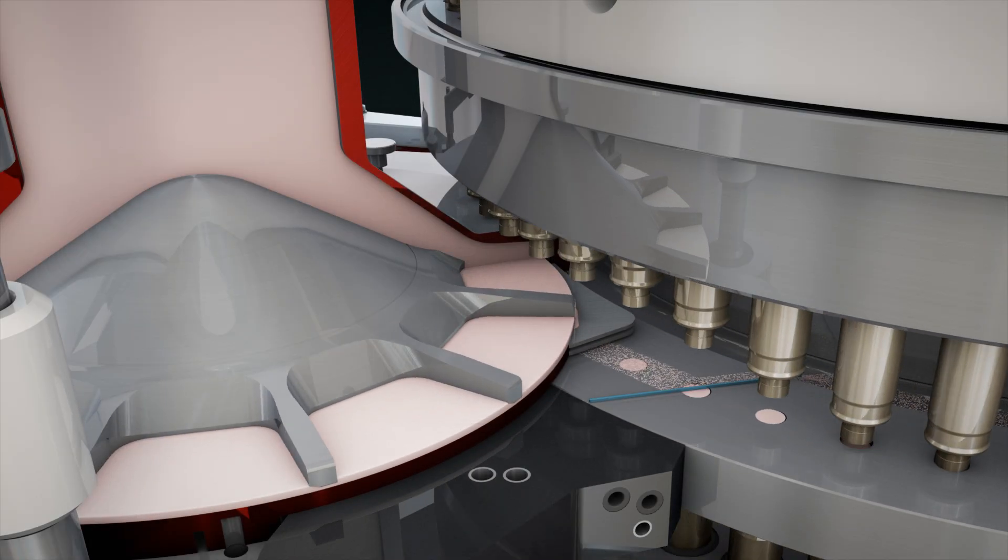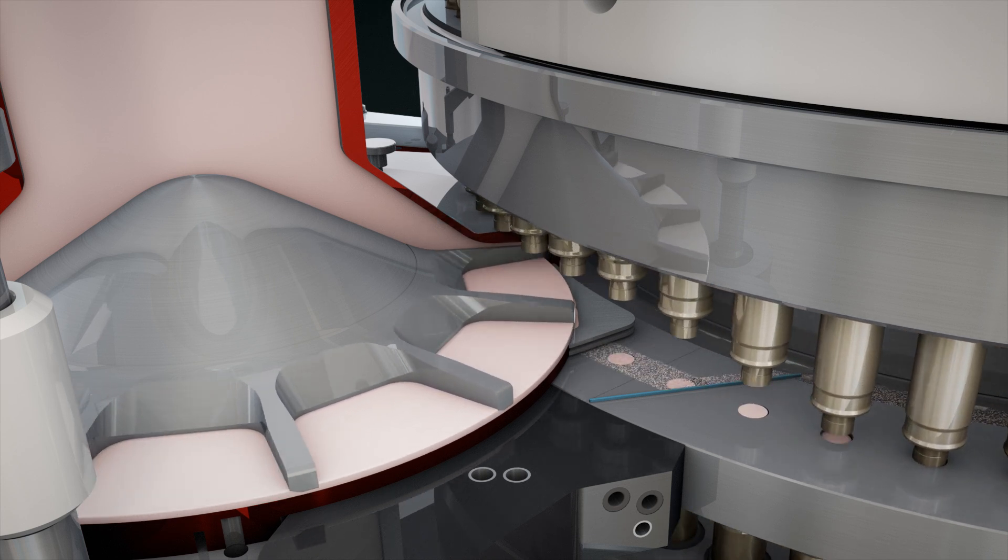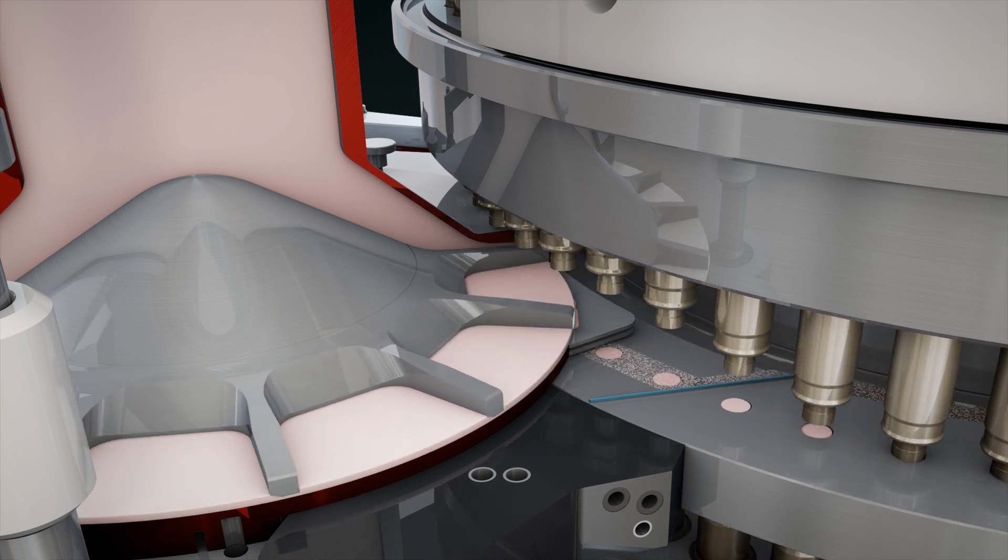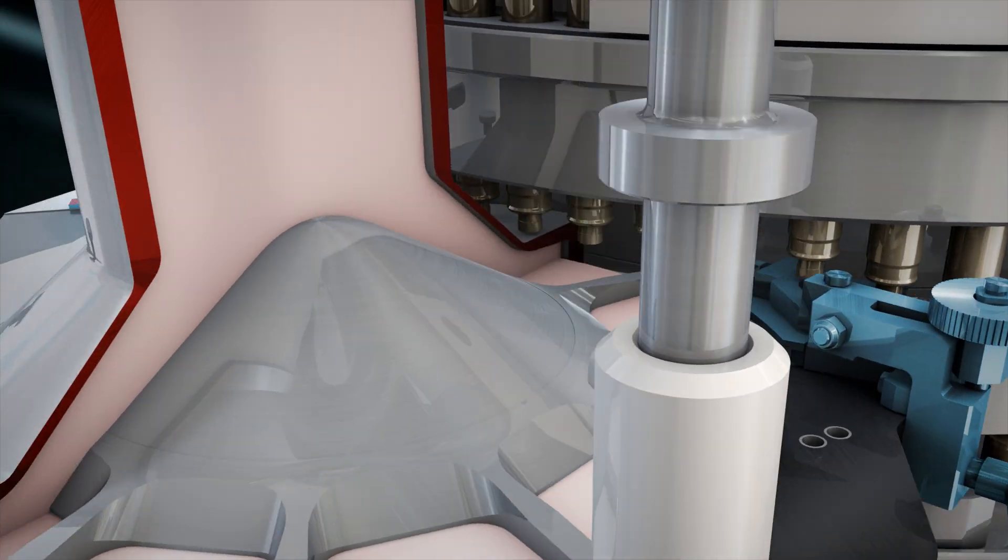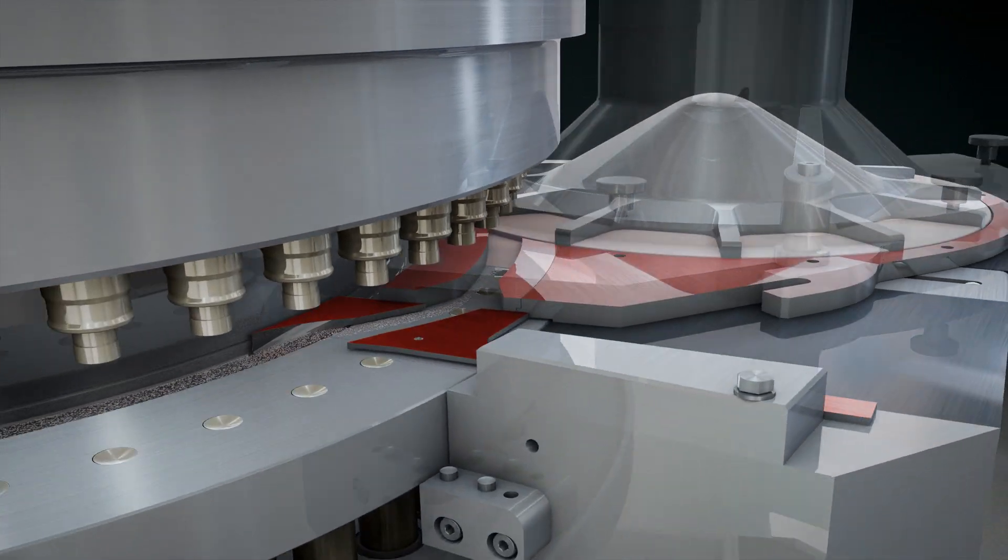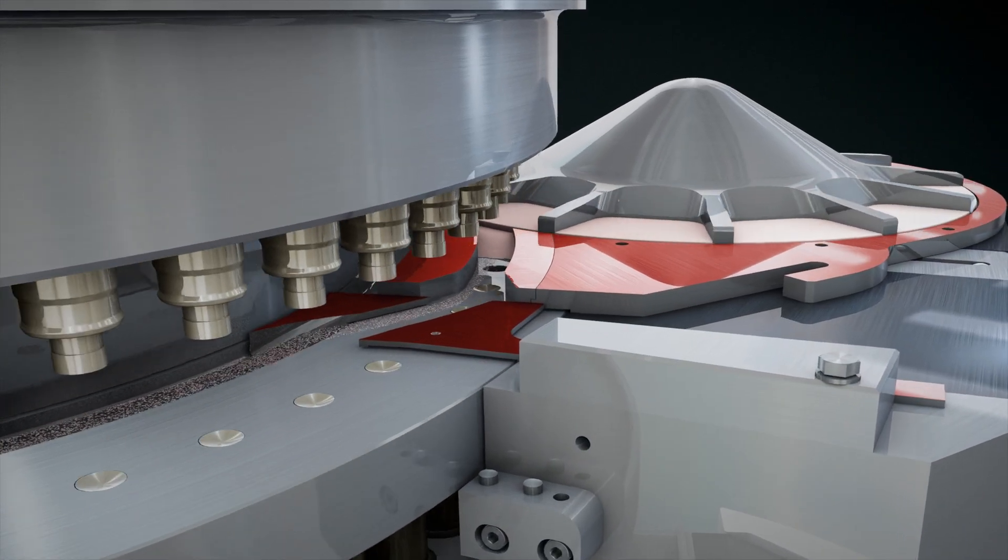Fine residue product, which is on the surface of the segment, is transported by a scraper blade into the inner channel. This material is again returned to the filling device and supports the filling.